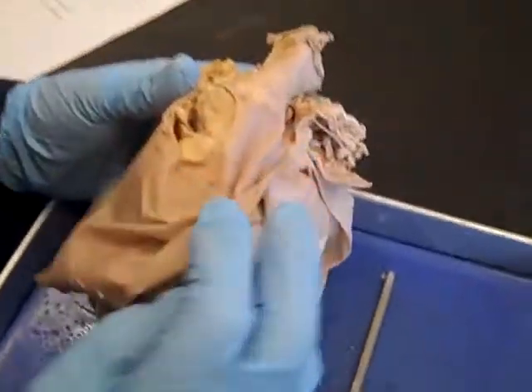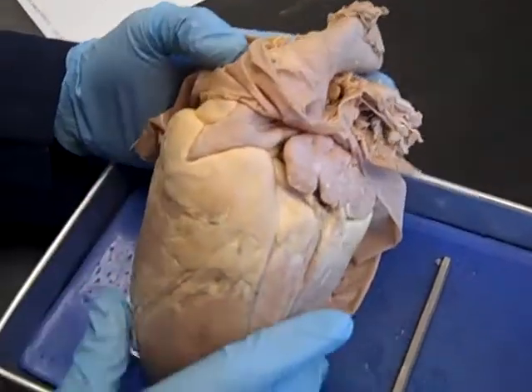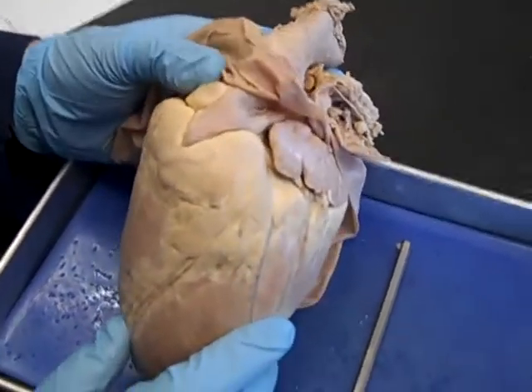We're going to cover the heart in this video — we'll probably split it into a couple of pieces. The first thing we want to do is orient the heart, so we're going to pull this piece of material back and I'm going to show you a couple of tricks that I use.